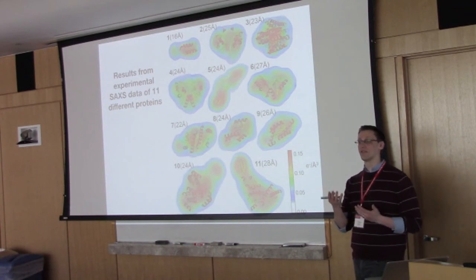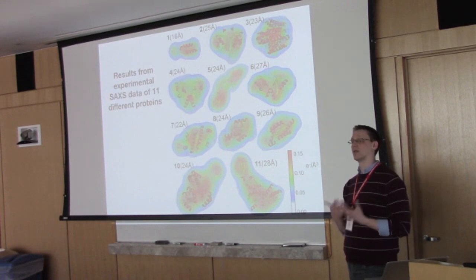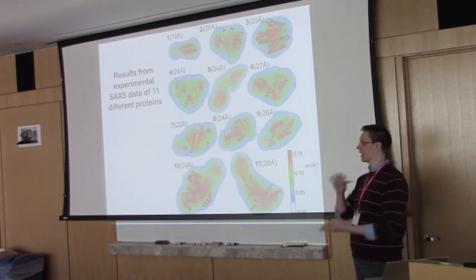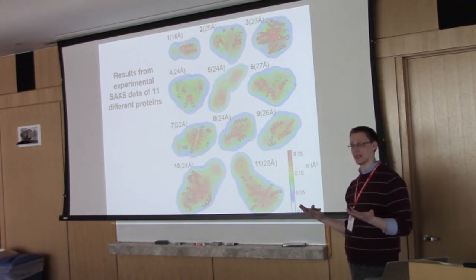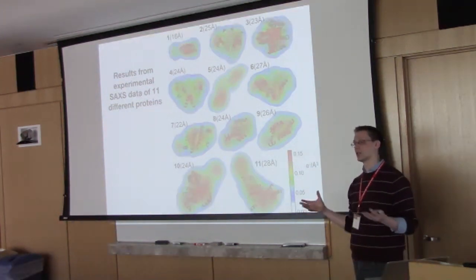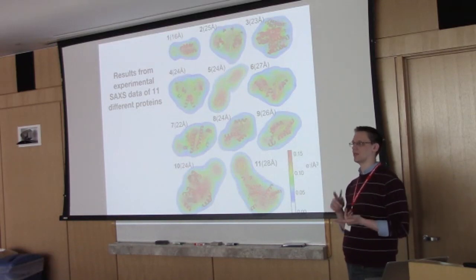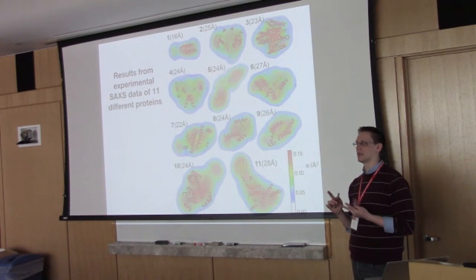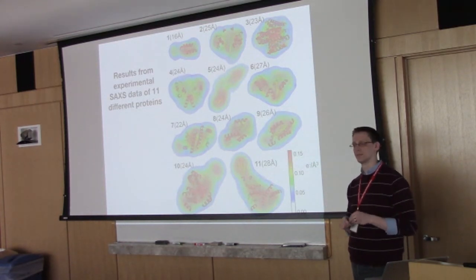That's just because of this idea of anisometry, there's implicitly more complexity to the shape of certain objects. If you've got something like that snowflake looking thing, that's a really complex shape in addition to being a large and flat object. So it's a combination of the size of the object and the complexity of the shape.